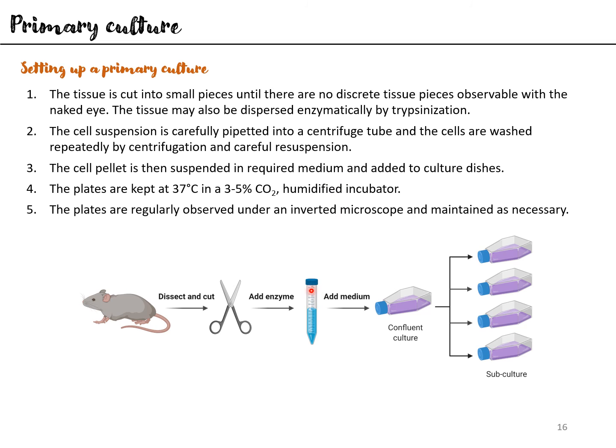So now you have your cells collected in the centrifuge tube, and you have spun it repeatedly, and you have washed the pellet. Now you have resuspended it in your medium of choice, and you grow it in these flasks. Once your flask is confluent, then you subculture it or passage it, and you simply expand it as required.